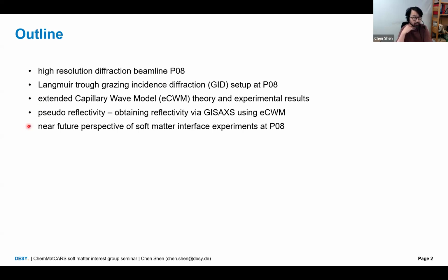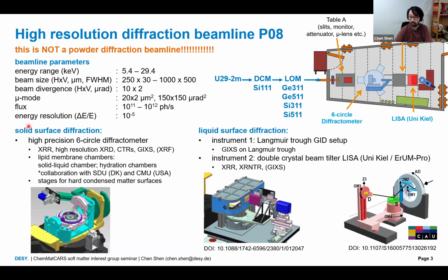So we are among several diffraction beamlines at PETRA III, but the name is high resolution diffraction beamline, and we are certainly not a powder diffraction beamline. This is usually where people get confused.